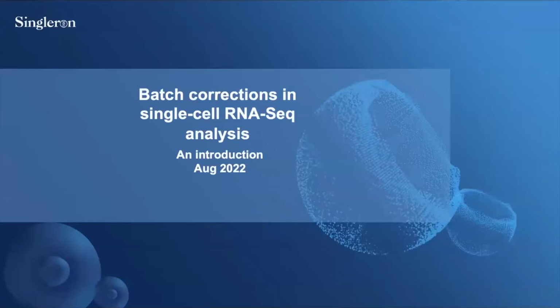Multi-omics data. So in this webinar, we will discuss the causes of batch effect occurring in single-cell RNA sequencing data and how to remove them. Also, the different methods for data integration coming from multiple layers of information and their pros and cons. So in summary, we will cover what is batch effect, how it can be removed, and what is data integration in multi-omics. The talk should last about 45 minutes, and at the end, we will have a Q&A session for around 15 minutes.